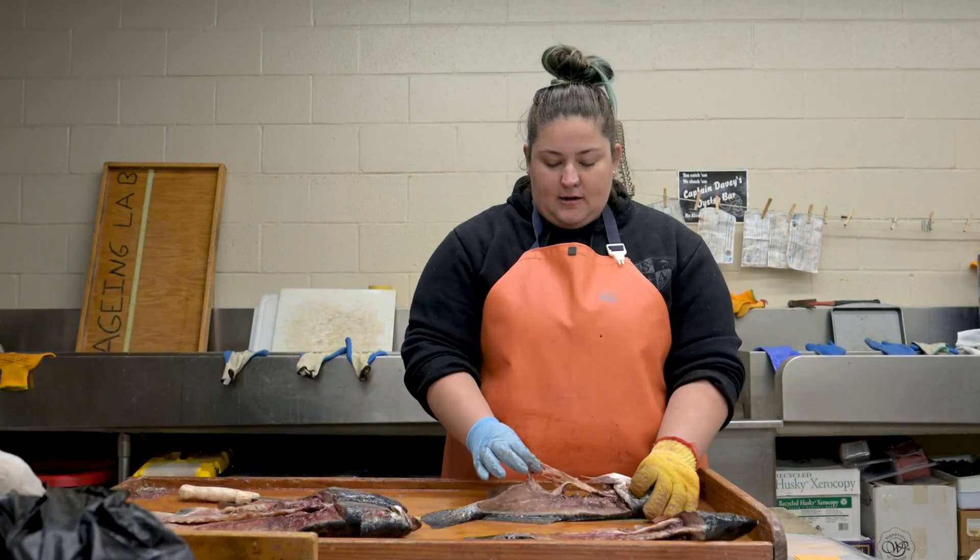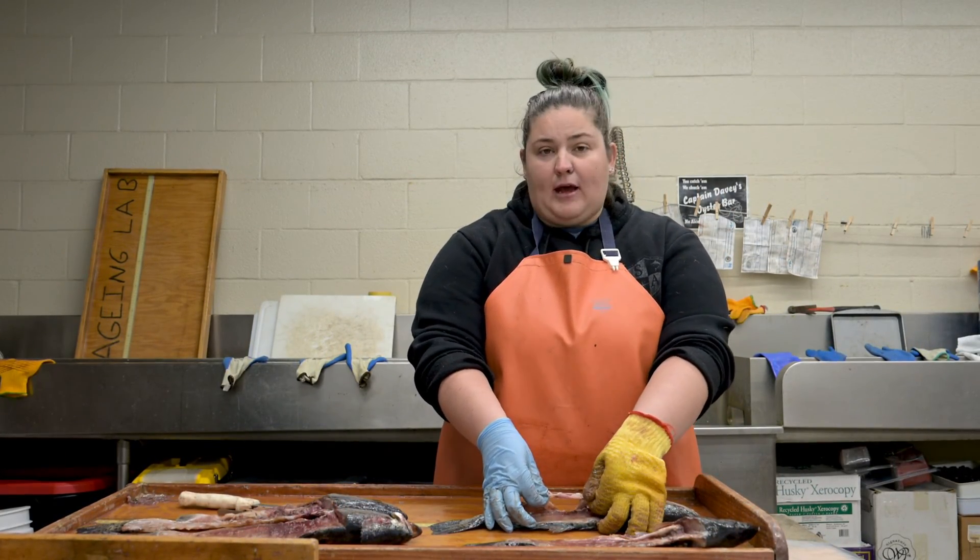With the gonads left intact and part of the body cavity, I can tell that this right here is a male speckled trout.